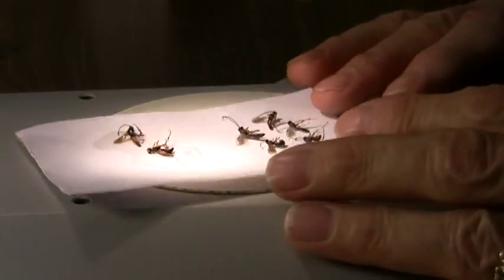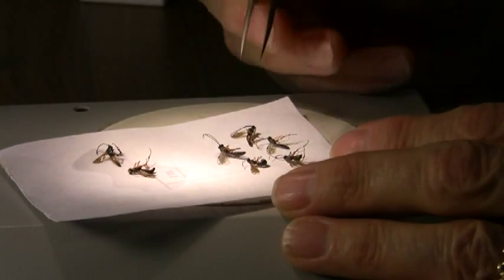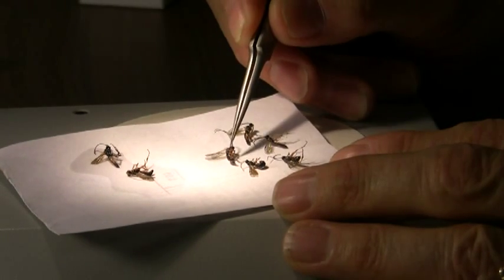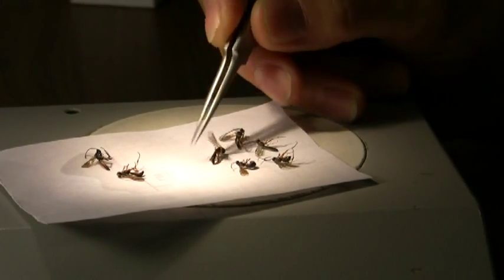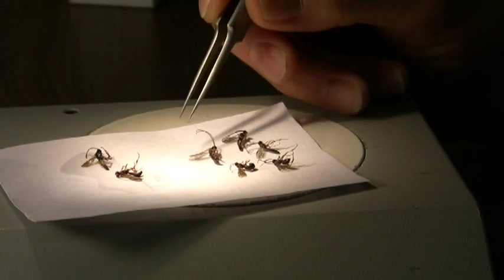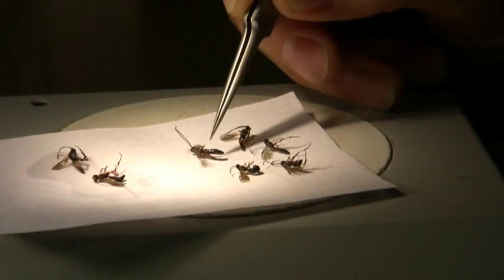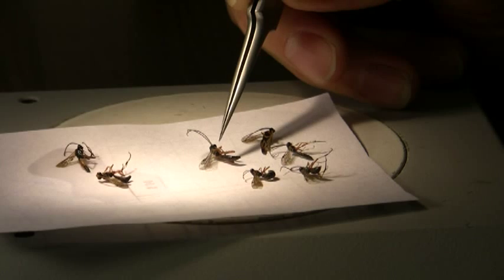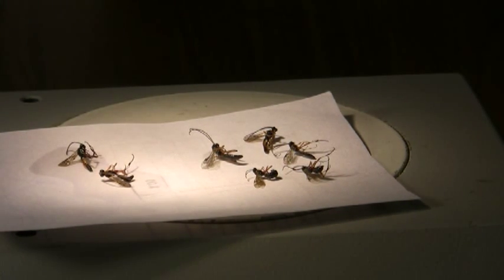And again, like most of this, it is much better done under the microscope. So I'm just looking at the specimens and trying to find the correct place to glue them. And the correct place is basically on the side of the thorax, slightly behind the wings. So I'm just moving these around. And the way to do this is to glue it on the insect's right side. So I'm laying the insect on its left side, and this provides me with access to the right side. I'm going to take a little bit of the glue, same glue we used before.